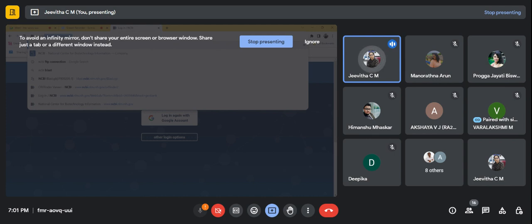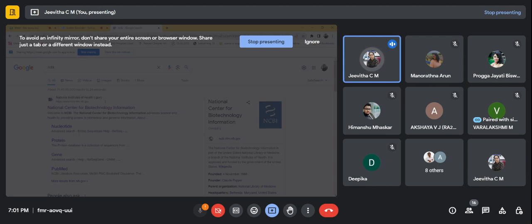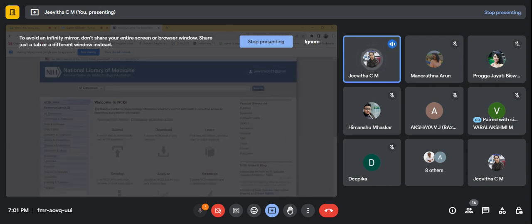But the other condition is, you just have the sequence, but you don't know what that sequence is. For example, you have given your sample, some plant or some cancer cell or whatever sample it is, for NGS data analysis or some other data analysis, and they have provided you the output file where you will not have any annotation, any namings of what that sequence is.